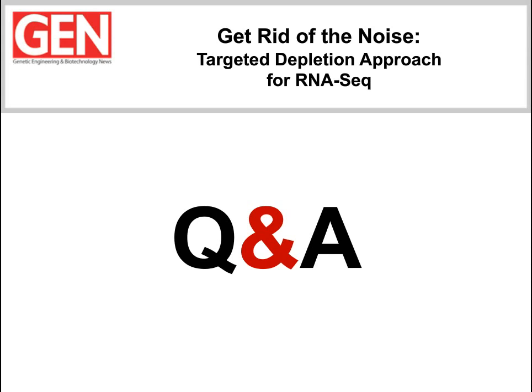Okay, great. Thanks, Maureen. Ashish, another question for you. Someone asked, how do I generate a custom InDA-C probe set?